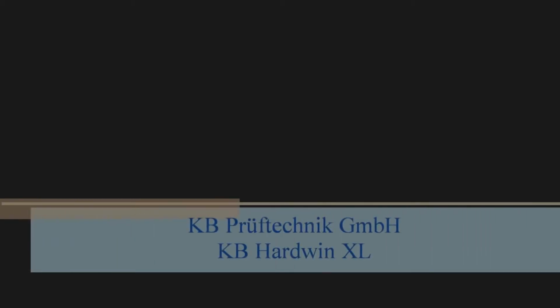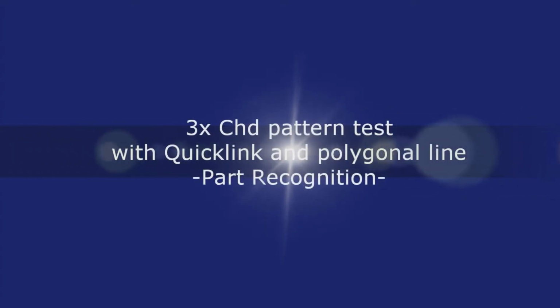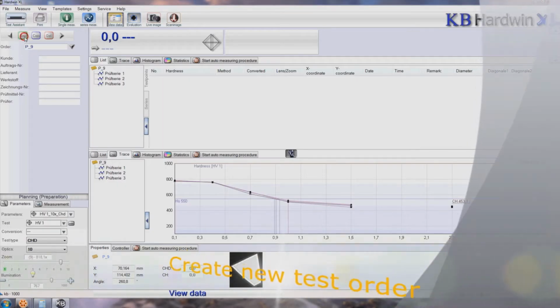Welcome to KB Prüftechnik. In this video we show you how to use KB Hardwin XL to create CHD patterns quickly and easily. First, create a new test order.